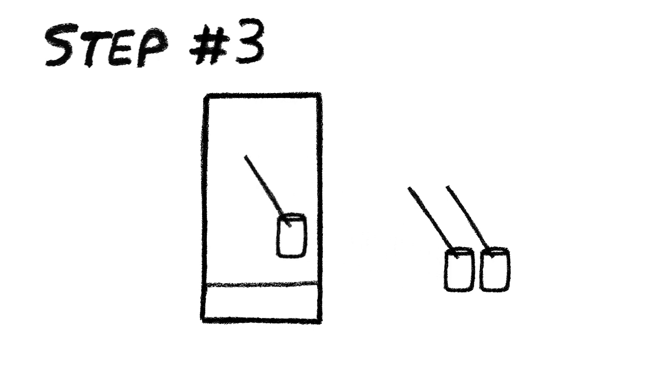Step number 3. After preparation, we can start to spot the TLC plate. We will first take a bit of the sample by using a capillary spotter and then gently pressing each sample along the drawn line. You should notice a small circle of sample being added onto the plate. The spots should be away from the edge to prevent the compounds from streaking on them.